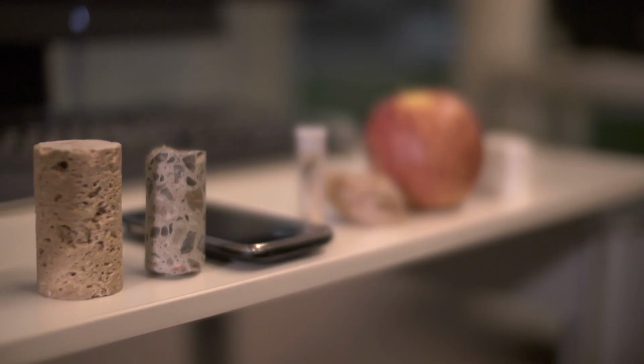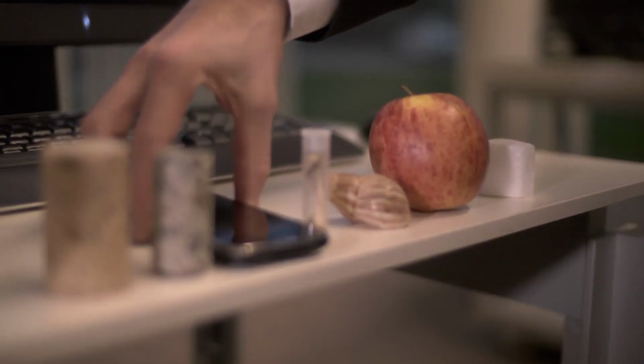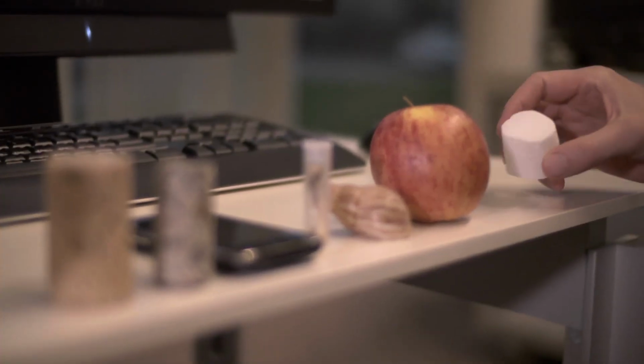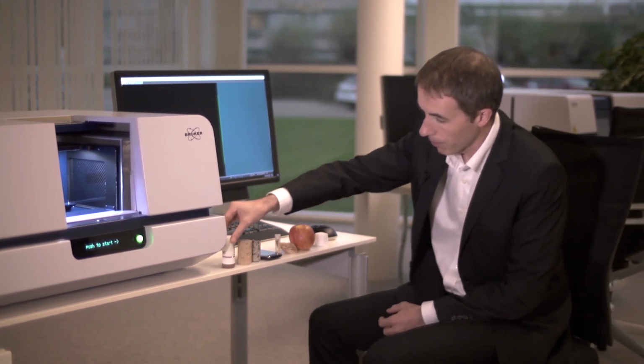In front of me I have a wide range of samples covering both material science and life science applications. As you can see, I have an inhaler, some geological samples, an electronic device, a bone, shell, apple, even a very low dense sample like a foam can be scanned using this device. I'll demonstrate this today by scanning the inhaler.